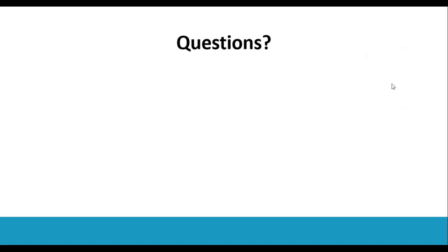So people are submitting their questions, Daniel. We have got our first one in, so I'll just give that to you. Are there any limitations to using DVS or IGC for BET surface area determination?